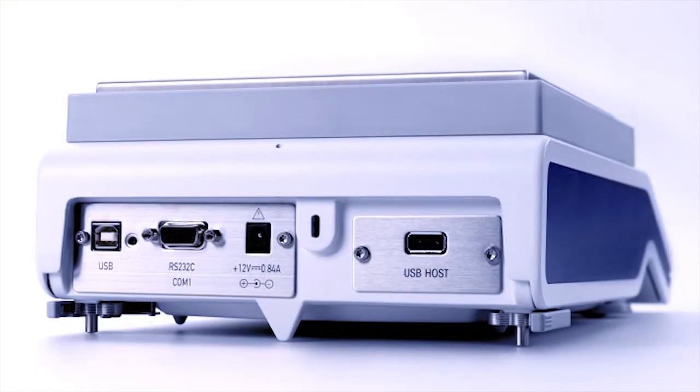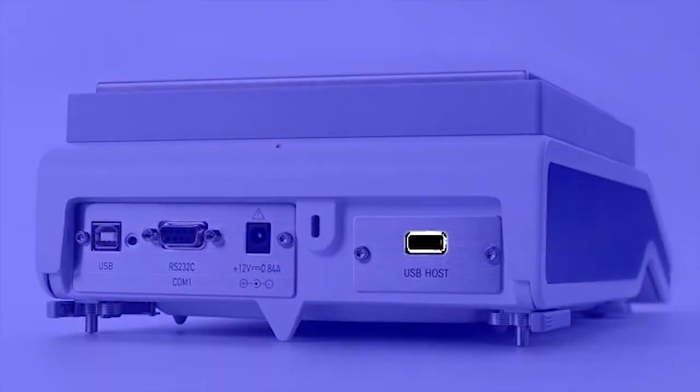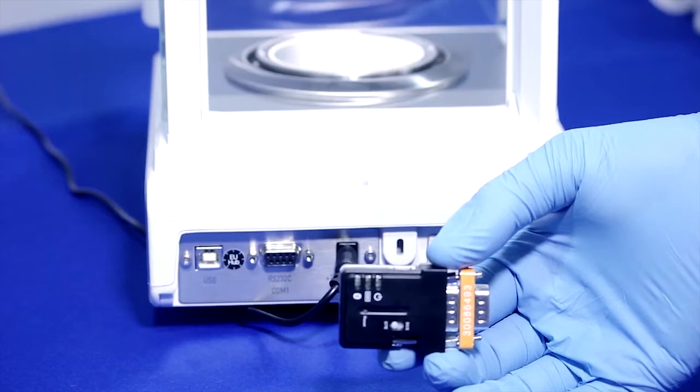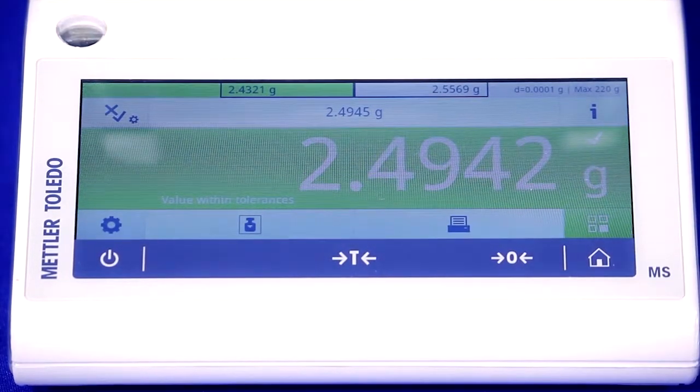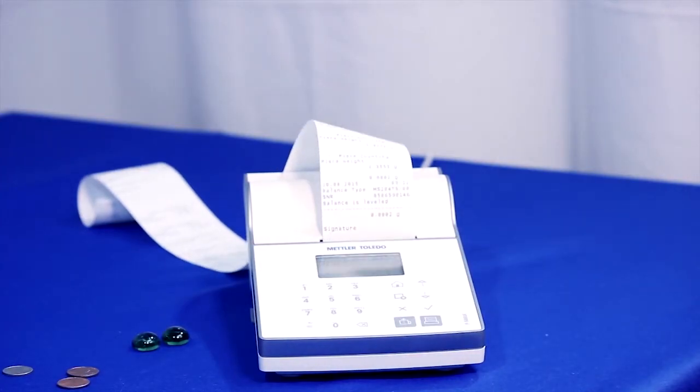The last feature I want to highlight is connectivity. Three interfaces including USB host and device and RS-232 allow you to easily connect to printer and barcode reader peripherals. Data transfer is also simple and secure. You can even choose to go wireless with a Bluetooth option.